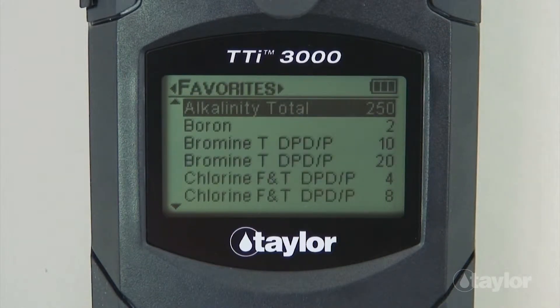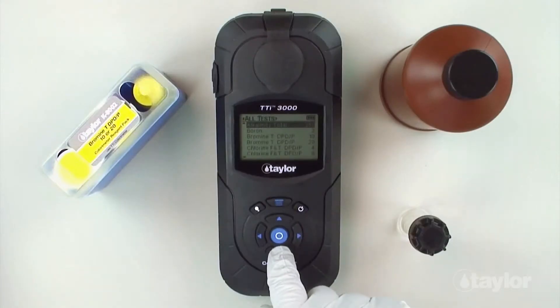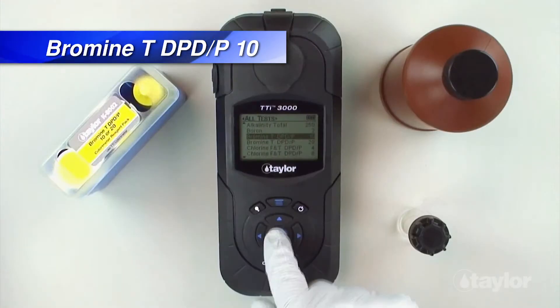For this demonstration, we will select the all tests menu, which contains a list of pre-programmed Taylor tests. If you have added the bromine total DPD-P10 or P20 test to your favorites menu, it can be found there also, or in the recent test menu if it's a test you have performed within your last 10 procedures. Scroll down to locate the bromine test of your choosing and press enter.